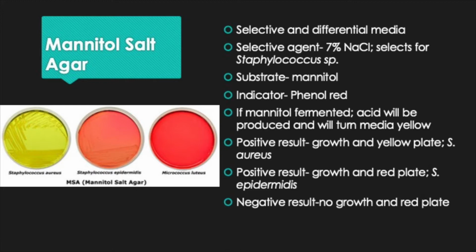Not all bacteria can ferment the mannitol. Respiration is where the bacteria takes the mannitol, does glycolysis, Krebs cycle, puts those electrons through the electron transport chain, and ultimately makes water. So you have fermentation, which is acidic end products. Then you have respiration, which is basic or neutral end products, water. Okay? So there's a huge difference there.